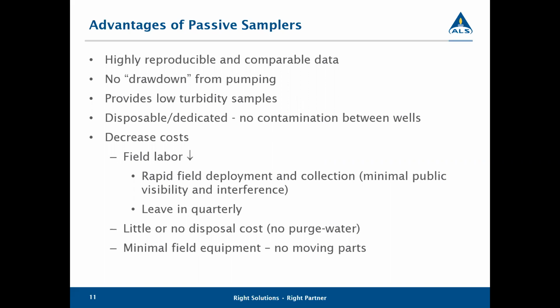and like it says here, minimal public visibility and interference. So you can be in and out, no large amounts of equipment to worry about, that sort of thing. You don't have to worry about any disposal costs. So if you are pulling purge water and you have to dispose of it afterwards, well, you might have to pay for that as well. With passive sampling, that's just not a factor. Same with the field equipment. No moving parts. It's one piece.